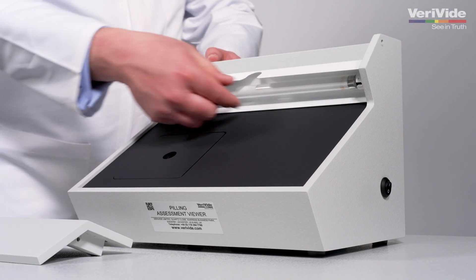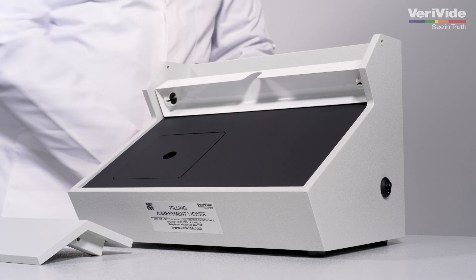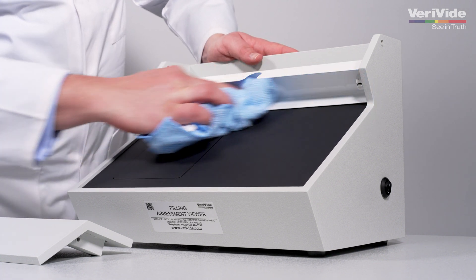Flicker-free illumination is achieved using a Verivide fluorescent lamp powered by a high-frequency electronic ballast. Together with the specially selected white reflector, the lamp illuminates samples at the industry standard.